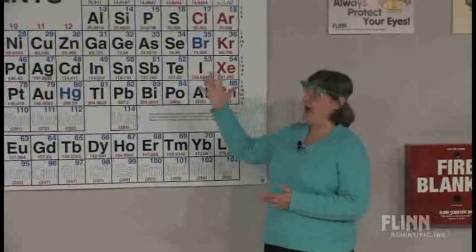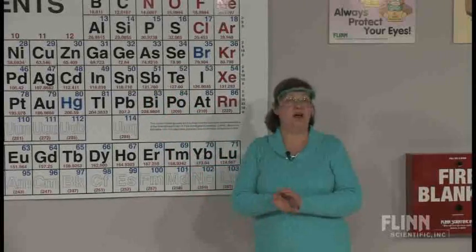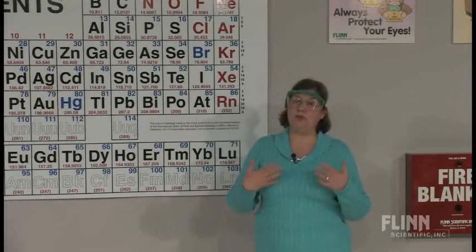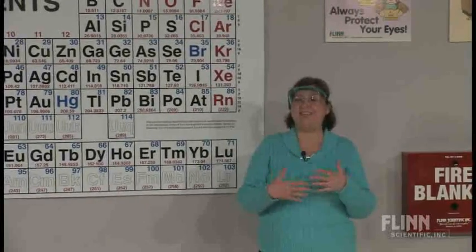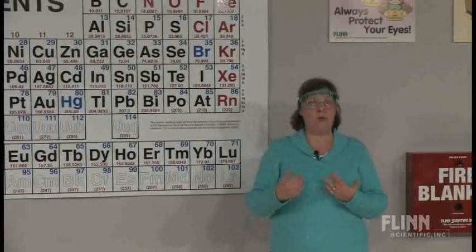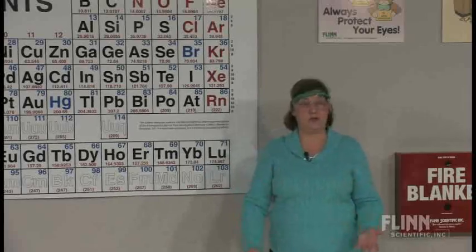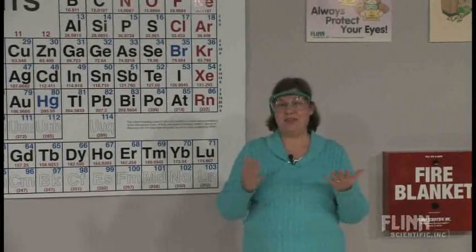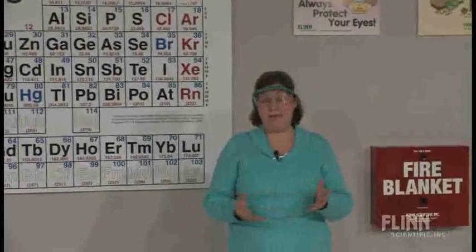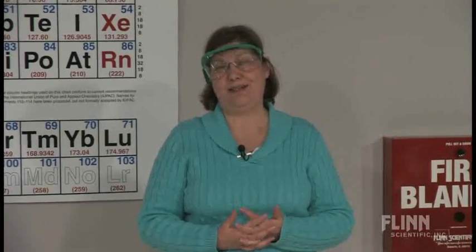So again, you have the power to predict, based on studies in one family, the properties of elements in another family. And that's really, I think, the most important lesson we need to teach our students, the power to predict and explain. And of course, if you go on, you would explain the reactivity of chlorine, bromine, and iodine in terms of the electronegativity of those elements and in terms of some of their other properties. So this is a demonstration or a lab that I call All in the Family, because we're clearly looking at similarities and differences within a chemical family of elements. Thank you.